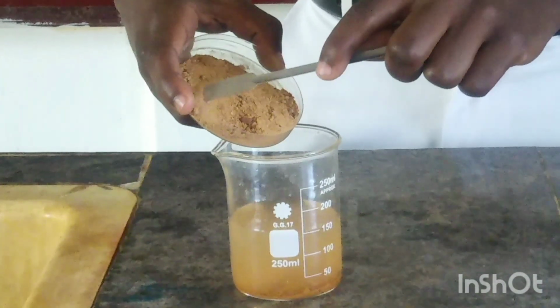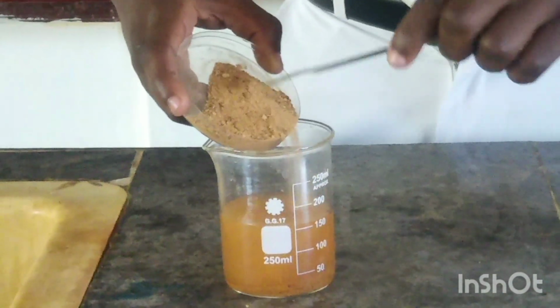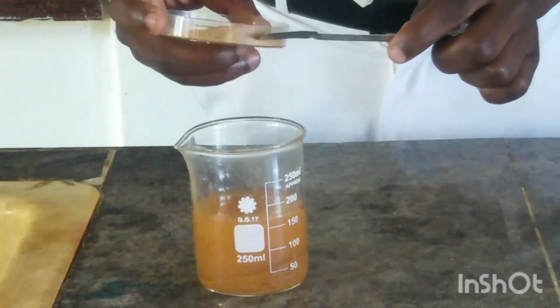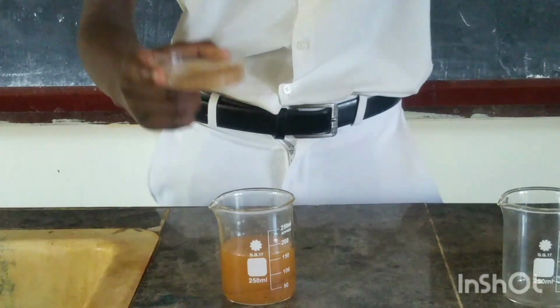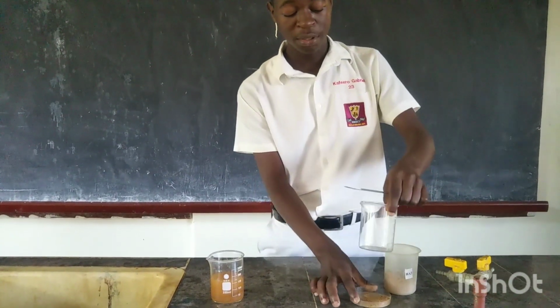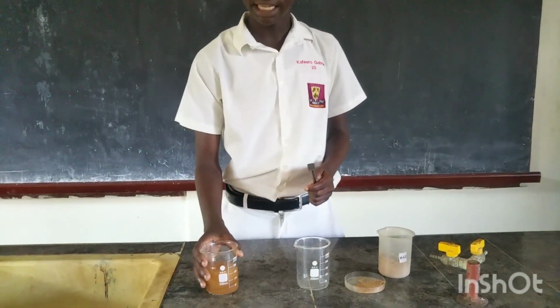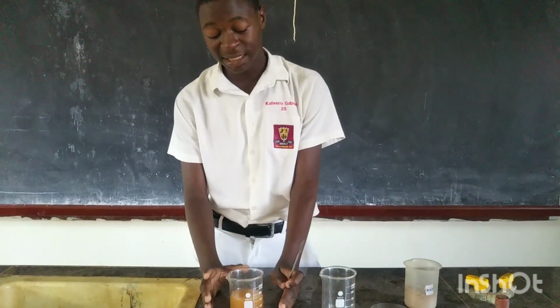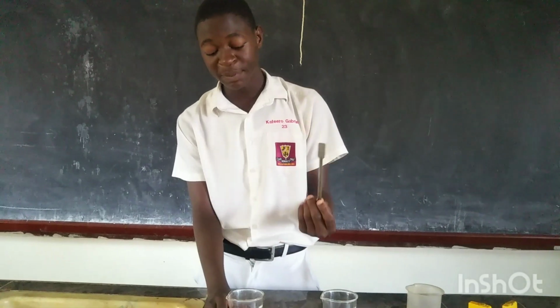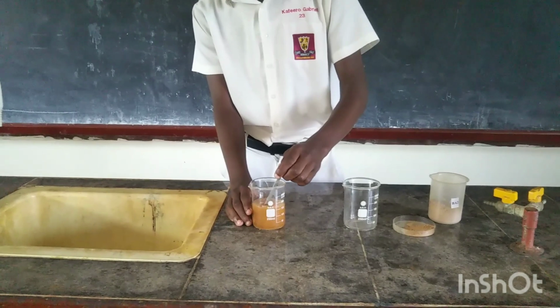Don't forget that our experiment is about separating sand from water. After mixing this sand with water, I think that will be enough for our experiment. This remaining sand, let me just place it here. So here is my sand plus water. What next? I need to mix these two substances, sand and water. I use this spatula and mix gently to make sure we get a uniform mixture.